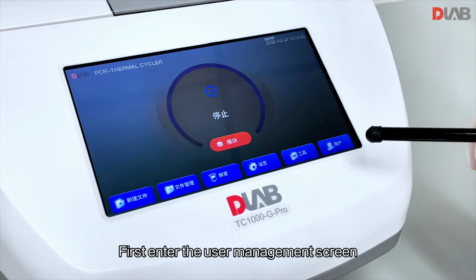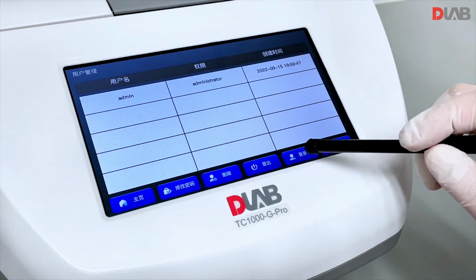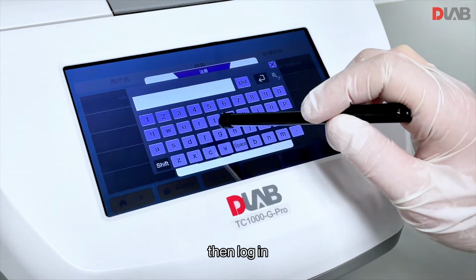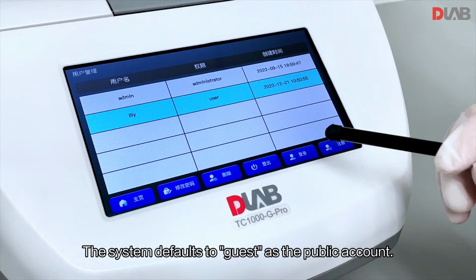First enter the user management screen. Register an account, set a password, then log in. The system defaults to guest as the public account. No need to register to log in.